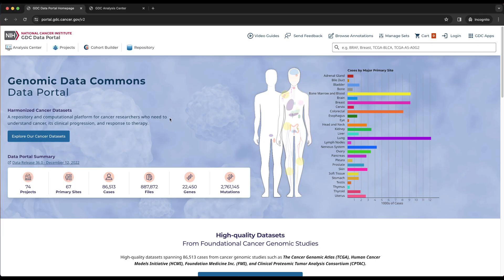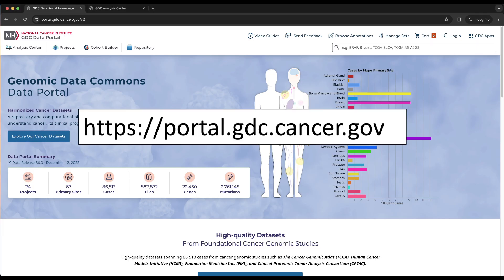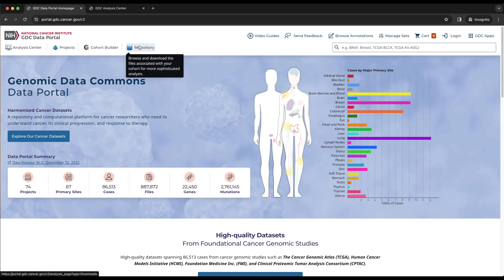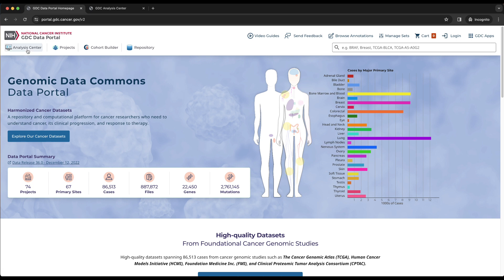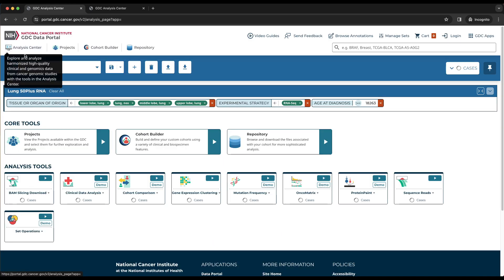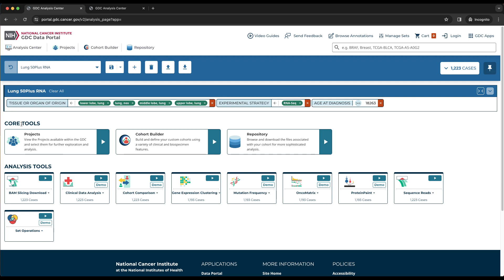Starting at the Data Portal home page, portal.gdc.cancer.gov, the repository tool can be reached by clicking on the repository icon at the top left of the page, the fourth icon from the left. The repository tool can also be reached from the analysis center by finding the core tool section in the center of the screen and clicking on the play button within the repository tile.